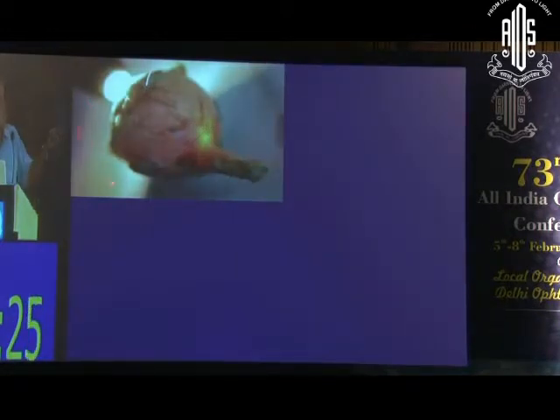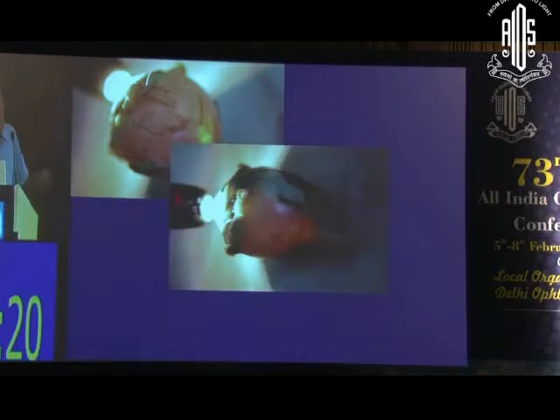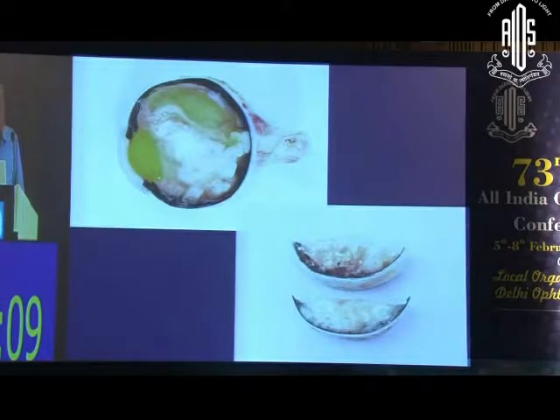You pass a light to the cornea, and this is how it would look in a normal eye. And this is how it would look if there's a tumor. This area is dark, so I know that the tumor is over here. Then I bisect the eyeball this way, and this is how an eyeball would look from inside. You have a detached retina, the tumor is arising from the retina, and what is this, the greenish colored thing? Yes, you're right. Those are subretinal exudates.